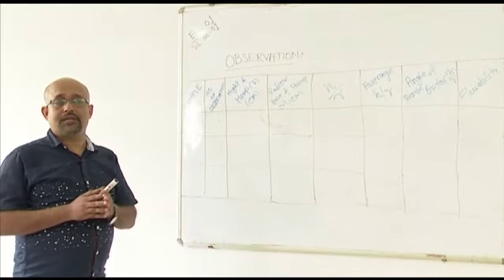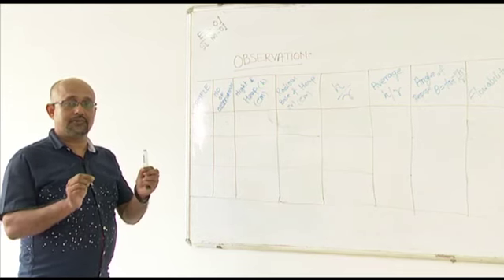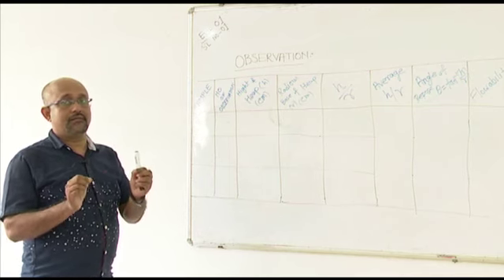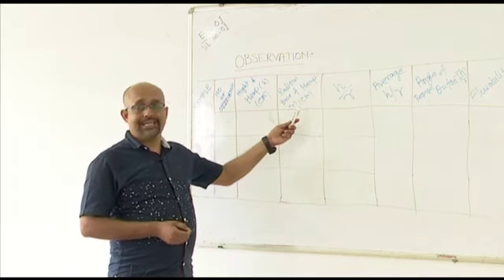During the measurement of the diameter, you should be careful that it is the maximum distance across the circle, because we know that diameter is the maximum distance. Then we should calculate the radius from the diameter.